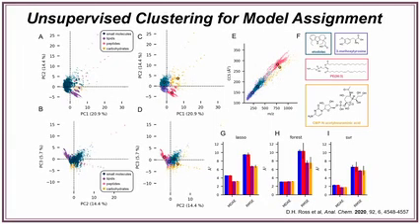Now, the two methods we had talked about before have one model that was developed. So MetCCS has one model that was developed for lipids. I think there's now another model for metabolites. Sometimes you don't necessarily know if what you have is going to look or be more like a metabolite or a lipid or some other kind of molecule.